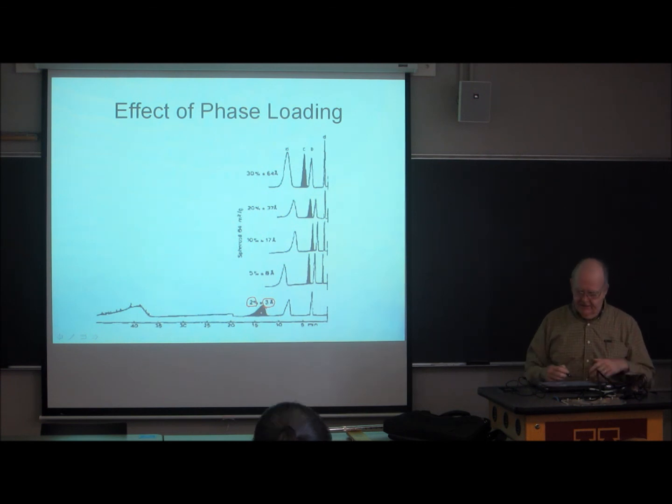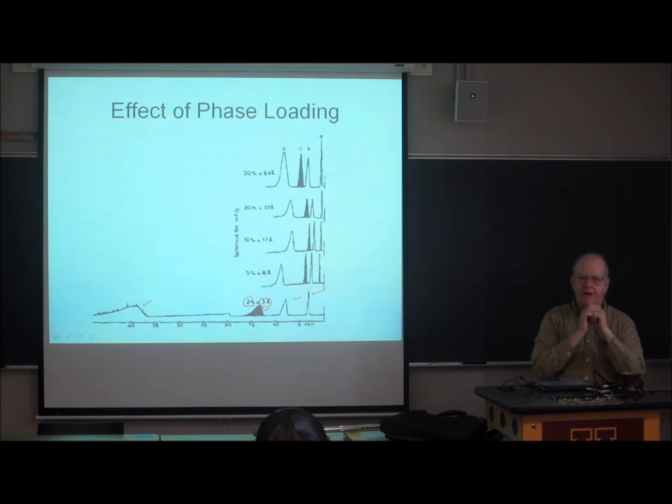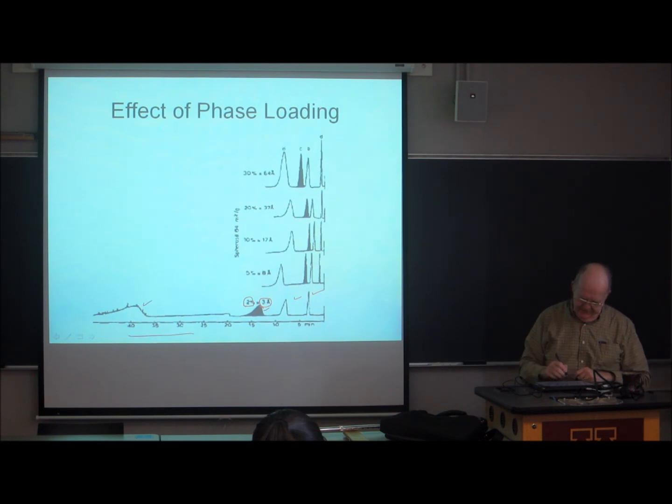And then they do a chromatogram, and I don't know what the mixture is here, but these are your chromatographic peaks. And they look pretty terrible. The surface is not uniformly coated. There are bare spots on the surface with no coating, and the sample is interacting with those bare spots and is desorbing from them slowly. And the more retained the solute is, and retention time is increasing in that direction, the slower the desorption rate is, and you get some really horrid looking peaks.